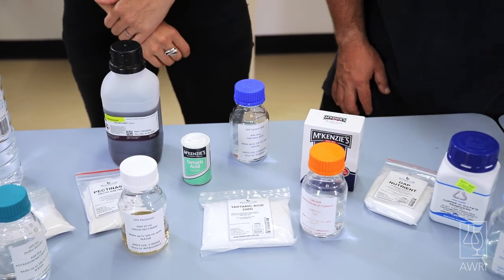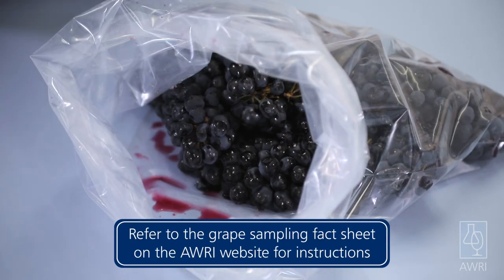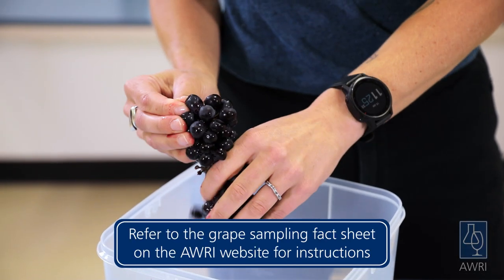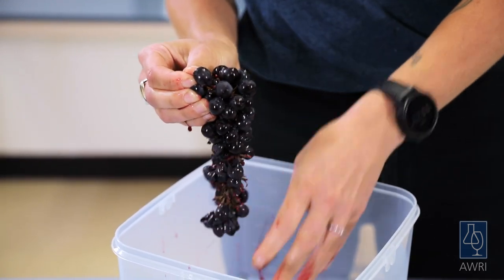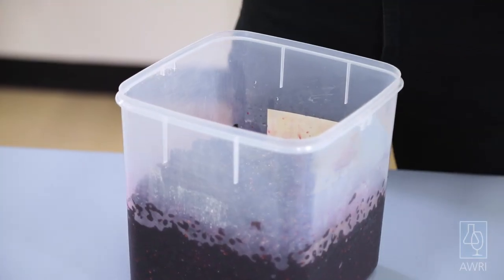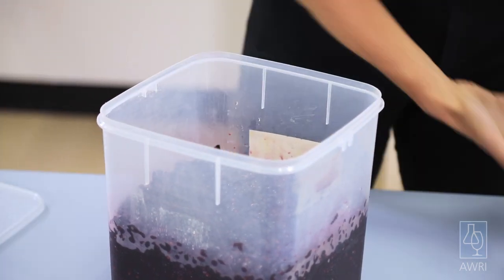Before you start, make up all the required solutions as listed in the fact sheet. You will need to collect a representative sample of grapes from the vineyard you wish to assess. Strip the berries off the bunches until you have about five kilograms of berries in a clean container or bucket. The bucket should ideally have a loose-fitting lid to prevent contaminants from entering while also allowing fermentation gas to escape.